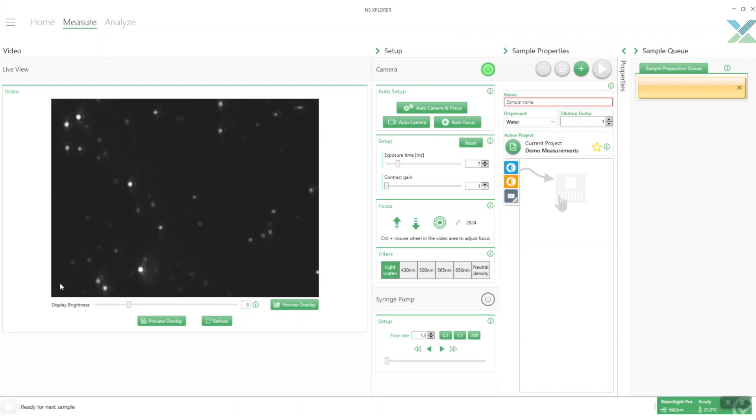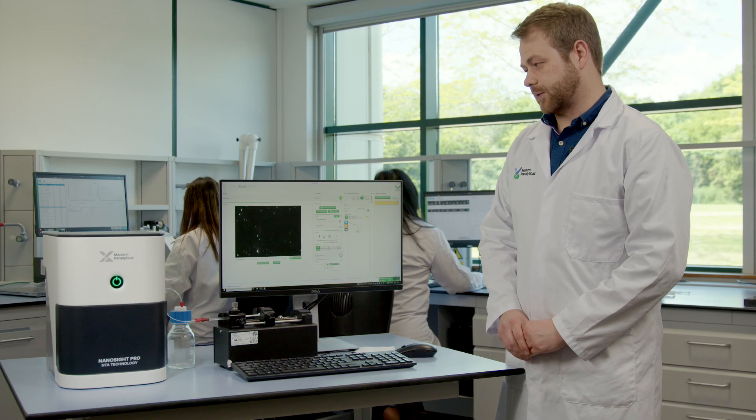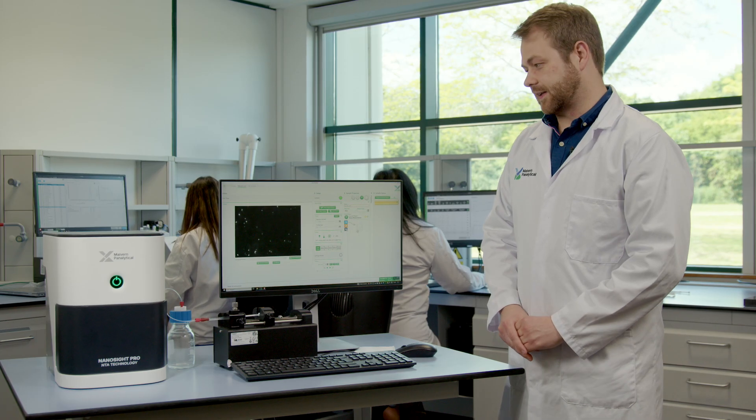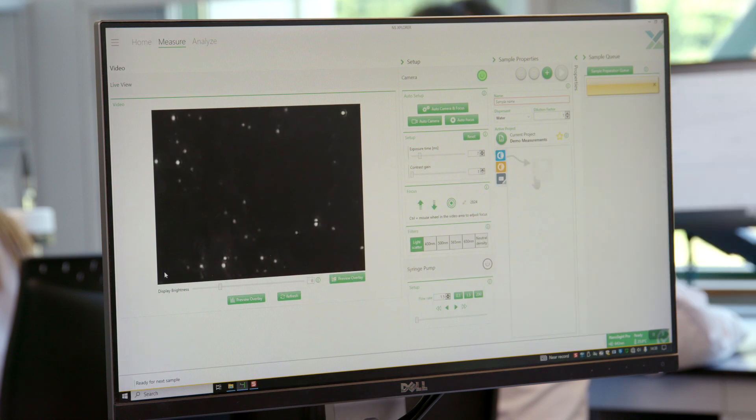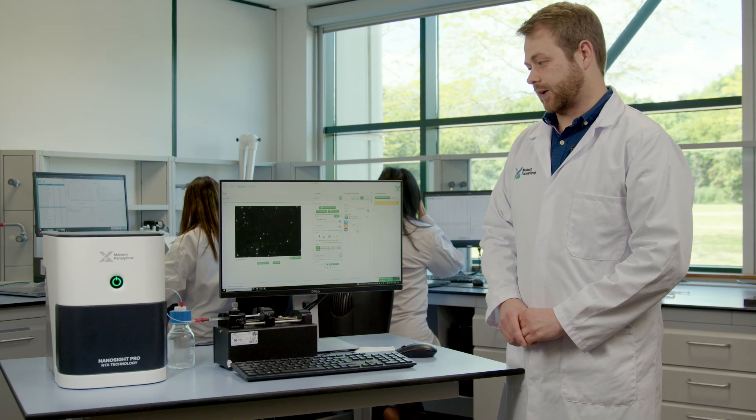They are undergoing Brownian motion which is what's causing them to move around in random movements and each one you can see is various different sizes and this pretty much correlates to what size they are in your sample.